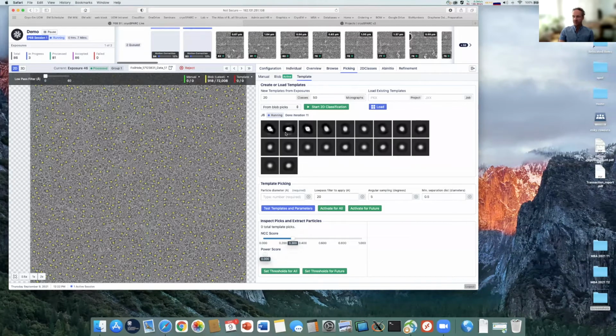I'll take a little break for questions. If anybody has any questions at this moment, just let us finish off this template creation. Anybody got anything out there? I'm not very good at this whole talking to my screen while people are listening, but let's see. I've got one thing on my little chat box here. Oh yes, that is not for the question. All right.